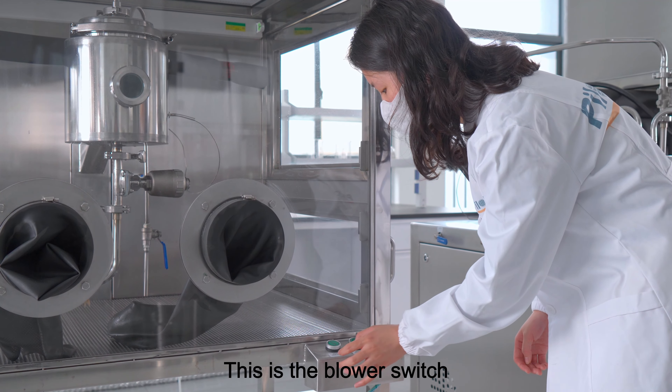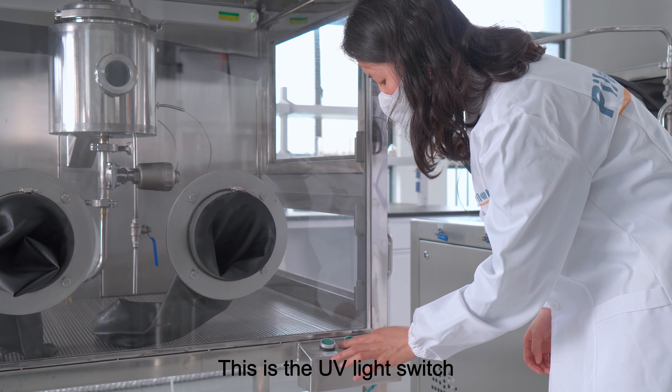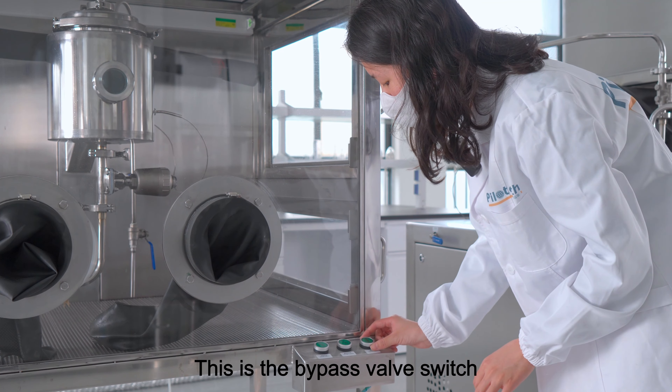This is the blower switch. This is the UV light switch. This is the bypass valve switch.